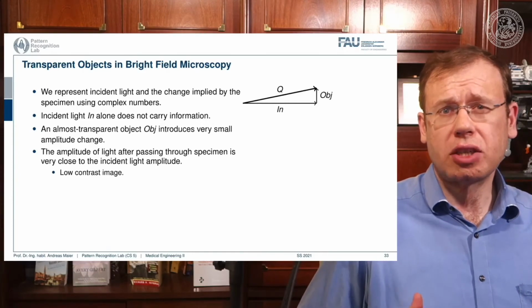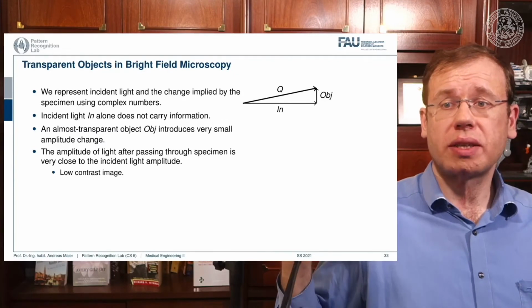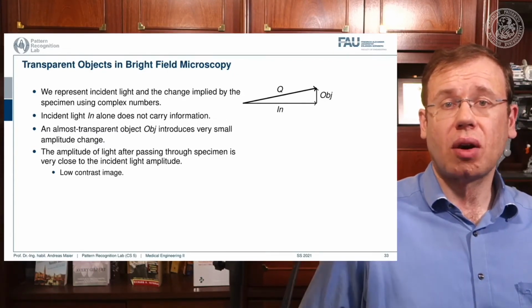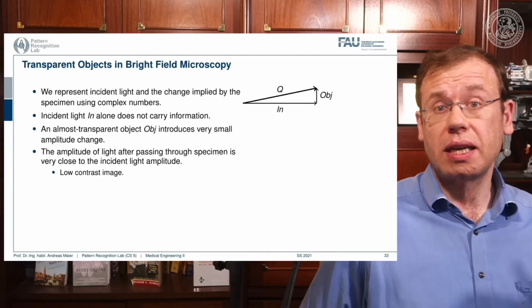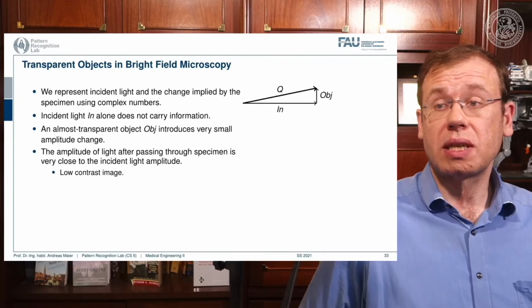So there is a slight change in amplitude here, but it's not visible for our system because the difference is just too low, because we only measure effects that are going along the x-axis. So we're not measuring anything that's going along the y-axis in this figure, and you see the difference along the x-axis is negligible. There's no difference.